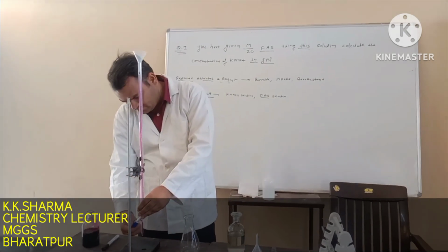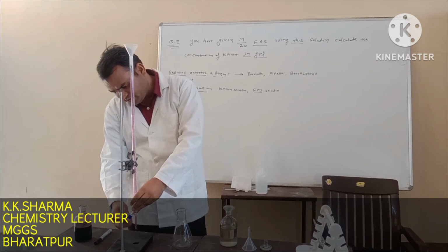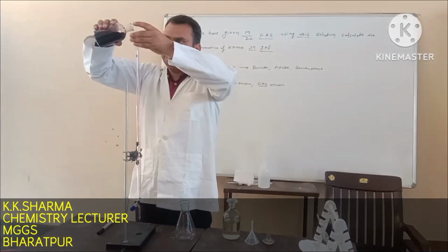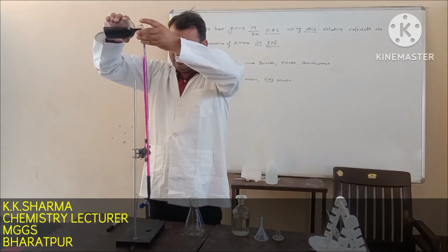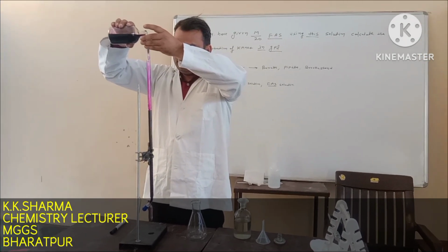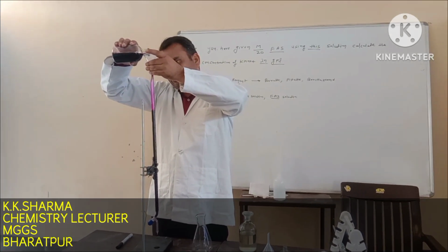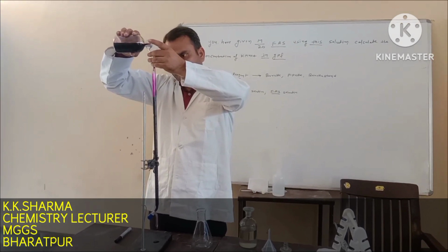When you fill the burette, you should check whether it is open or closed. It should be closed when you fill the burette. Then fill it. During the filling, you should check that there are no bubbles in the burette.